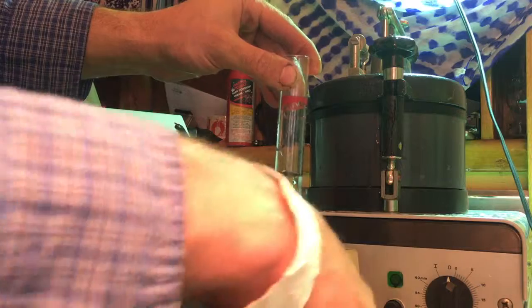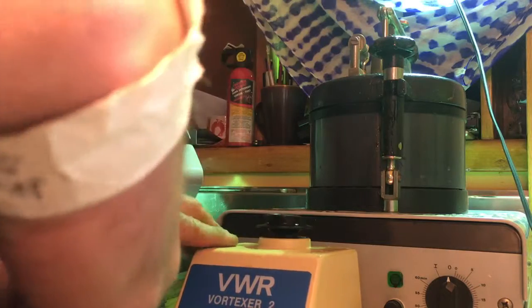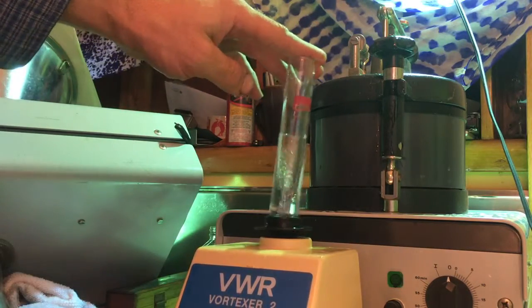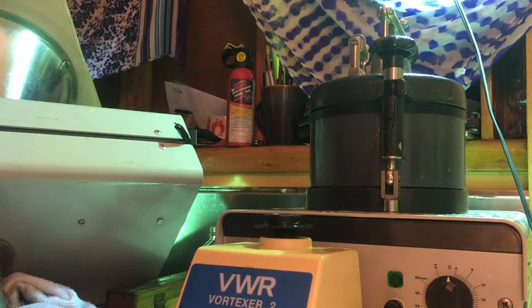You can switch it to just 'on' so it runs consistently. Look at that — that's sweet. That's it.